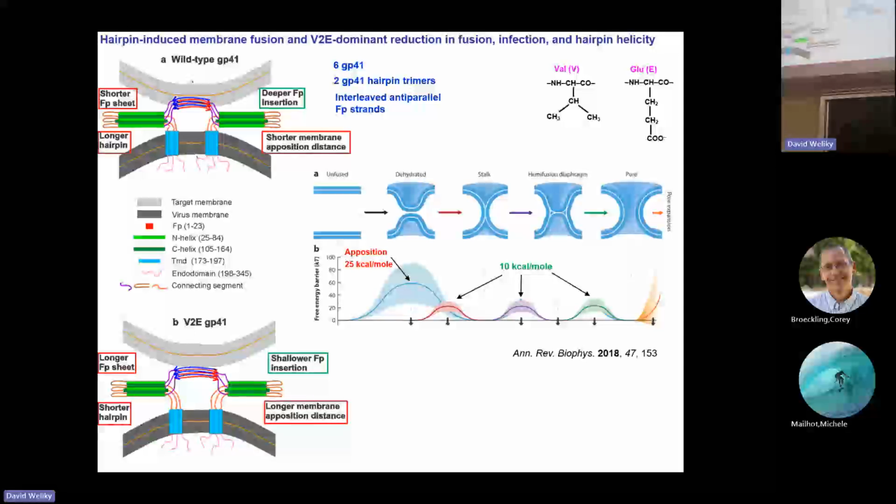So 10, and I guess this is now a property of any dipolar coupling. It goes as 1 over the distance cubed. So 1 over 10 angstroms separation has 8 times smaller dipolar coupling versus 5 angstroms. The 1 over r cubed dependence of the dipolar coupling really helps to attenuate couplings due to more distant carbon-nitrogen pairs.